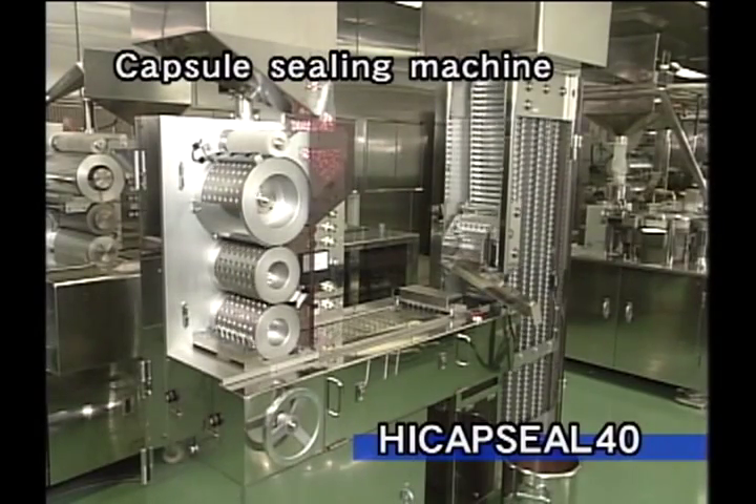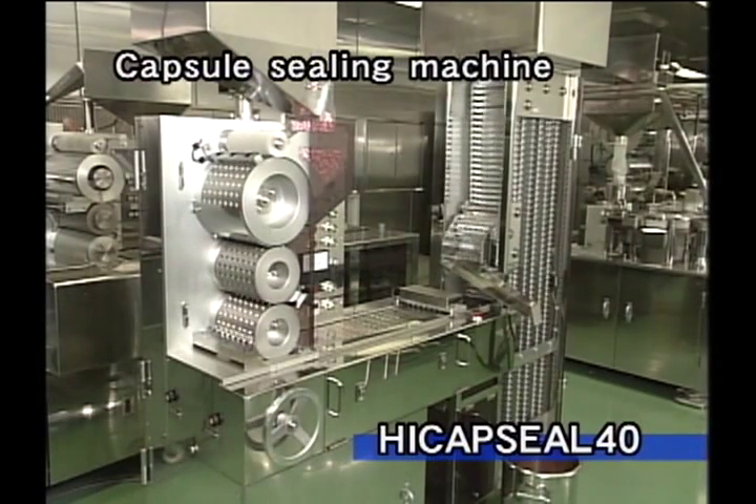This capsule sealer not only prevents the leaking of liquid from capsules but also seals the joint between cap and body very speedily.